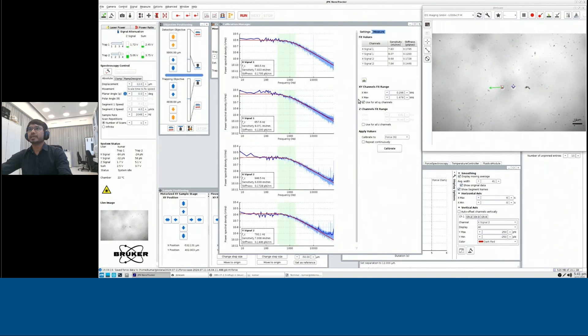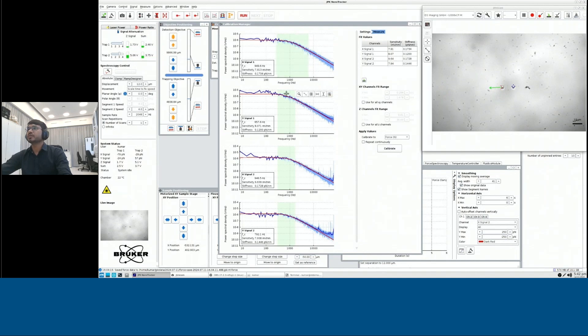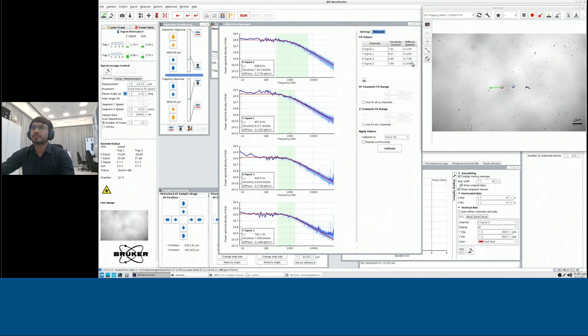And then all your calibrations, you could see the values of sensitivity as well as the stiffness of the trap.